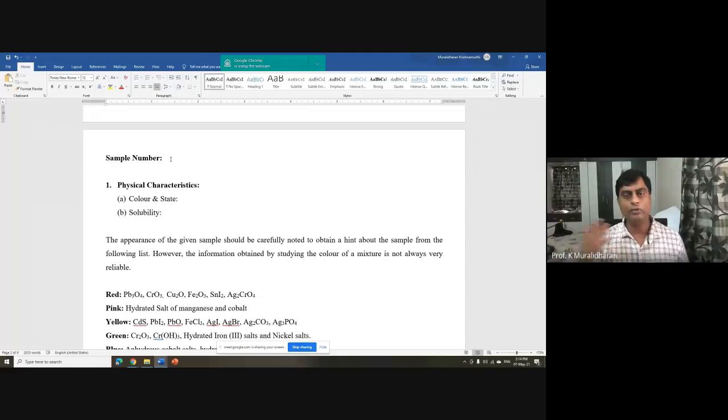Not only this, this practice matters, let us say, in future when you go to a clinical lab. In a pandemic situation, people are collecting samples for COVID, right? If they don't name the person on the sample and match it, then unnecessarily a COVID positive will turn out negative or a negative will turn out positive. So the first practice in any lab, chemistry lab, biology lab, anywhere, is naming the sample and matching it with exactly the right person.